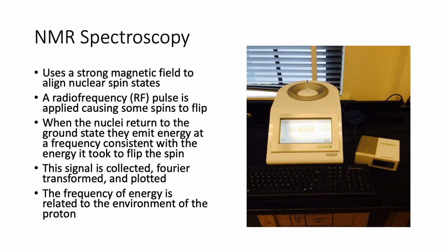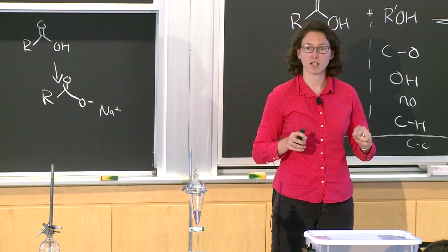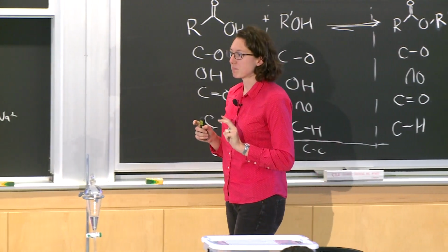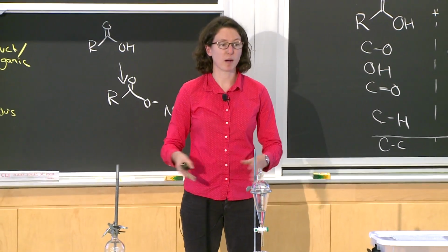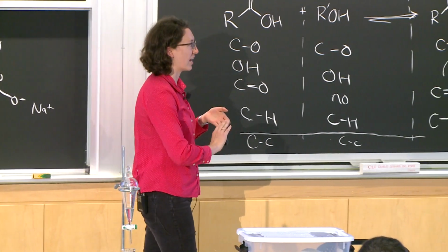The second to last technique we're going to use is NMR spectroscopy. How many of you have seen NMR before in your classes? A few people. All right. In about 2 weeks, Walt Mashevsky, who is the director of the NMR facility here in the chemistry department, is going to come and do a very thorough lecture on NMR and how it works and how to interpret it.